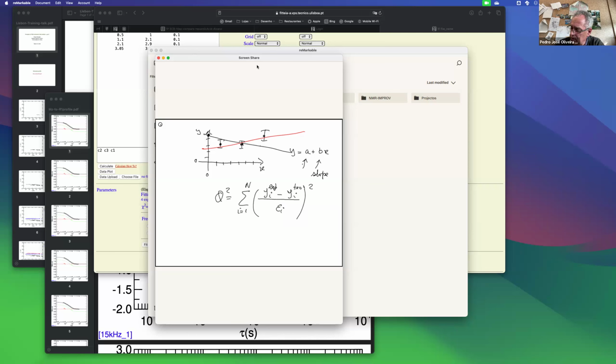So what does this do? It's actually calculating this difference here, this difference here, and this difference here. Let me put a point which is rather bad, this point. So this will be the difference being calculated, the difference between the experimental point, this, and the theoretical point, that. So I'm calculating this difference and making a sum of them.